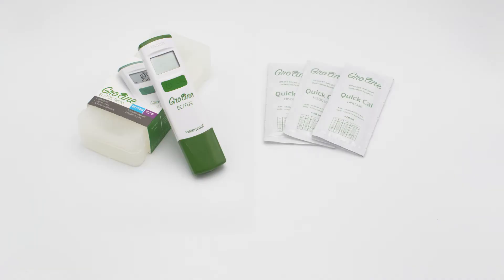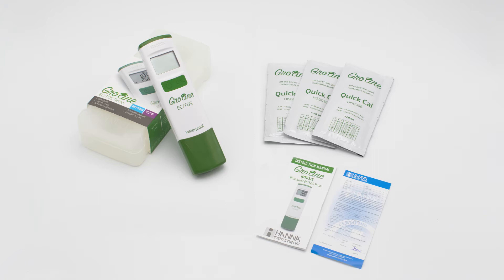Your HI-98318 GroLine tester comes with everything you need to begin testing. Along with the tester comes our GroLine quick calibration packets, the manual and quality certificate. Before running out of these solution samples, I recommend you check our compatible products on our website.